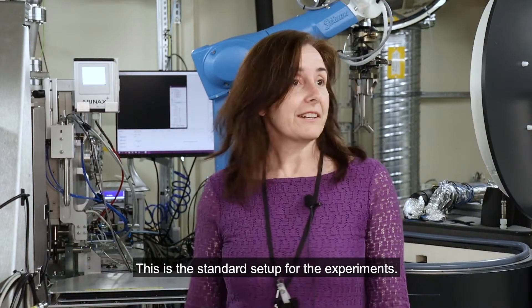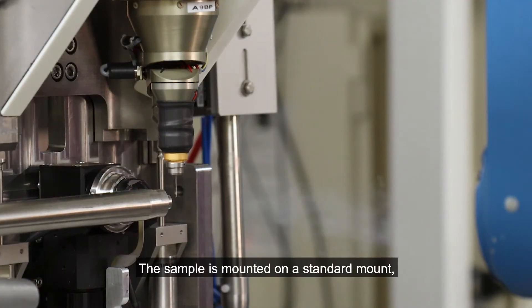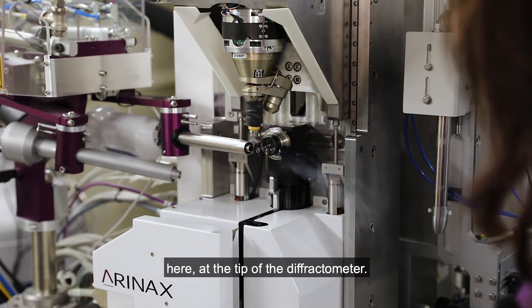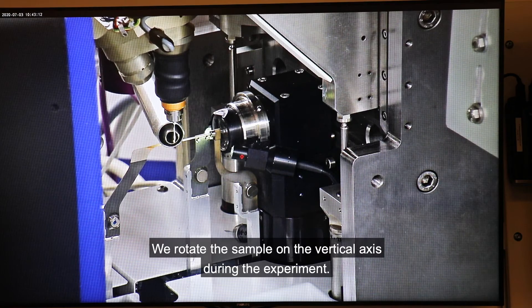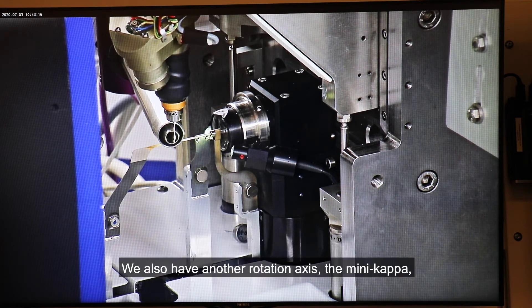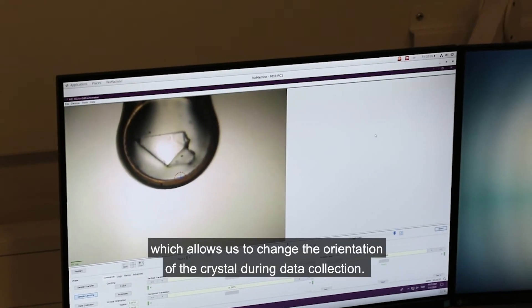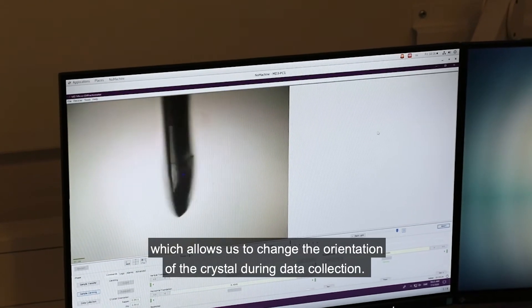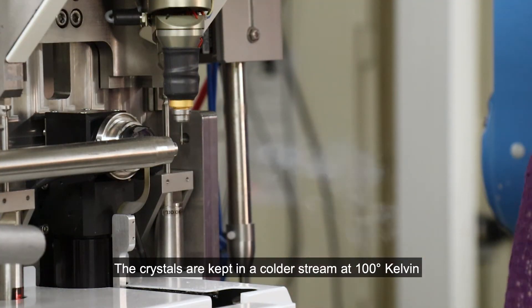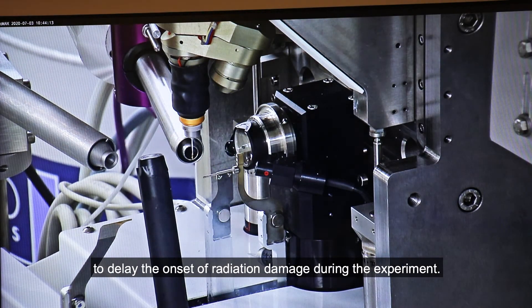This is the standard setup for the experiment. The sample is mounted in a standard mount here at the tip of the diffractometer. We rotate the sample around the vertical axis during the experiment. We also have another rotation axis, the mini kappa, which allows us to change the orientation of the crystal during data collection. The crystals are kept in a cold stream at 100 Kelvin to delay the onset of radiation damage during the experiment.